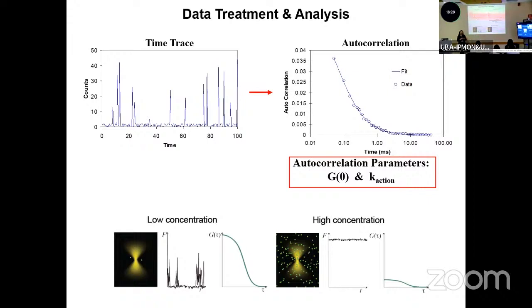There's an experiment that was done a long time ago. Can we just detect 1 molecule? If we wait long enough and that molecule goes into our laser beam, then yes, we will be able to detect it. And that's good enough to generate statistics, right?